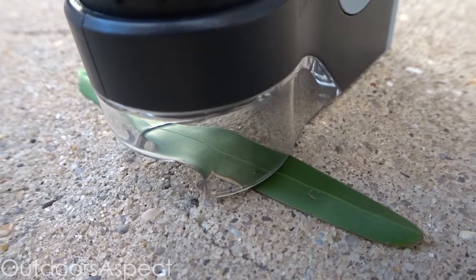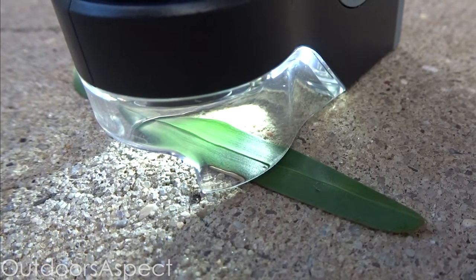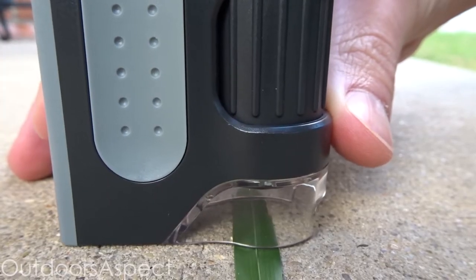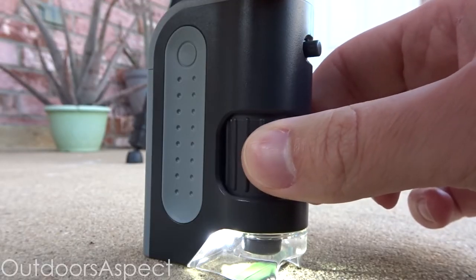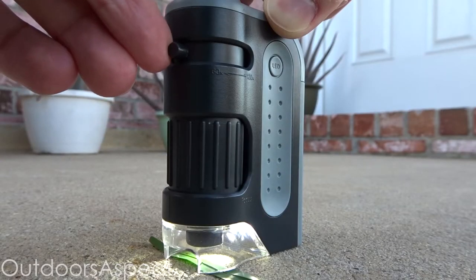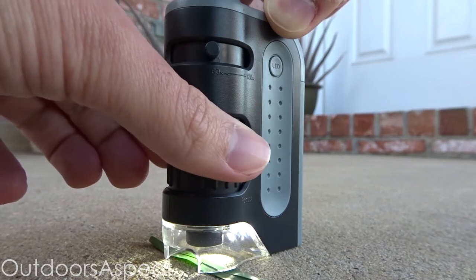First, place your blade of grass under the microscope. Next, make sure your LED light is turned on. Then look through the eyepiece — you might have to move the microscope around until you can see your specimen because it might not be completely centered. Lastly, use the adjustment wheel to focus until you get the clearest view possible. If you want a closer look, move the zoom knob to increase the magnification.